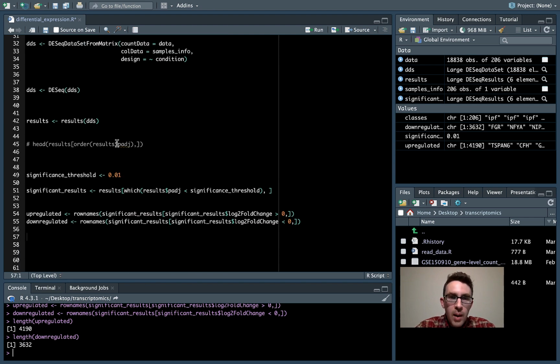If you remember back to the second lesson when we looked at the paper for this data set, I think they said, even in the abstract, that when they were doing their differential expression analysis, they adjusted the expression data for different information about the subjects, including race, gender, age, whether they smoke or not, and stuff like that.